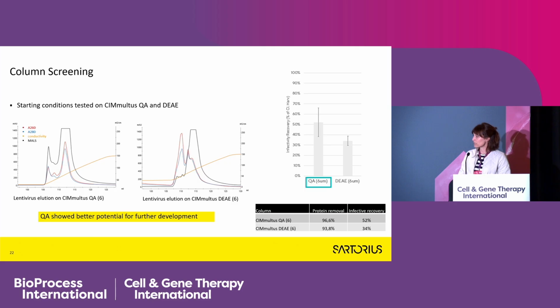We noticed that QA performed better than DEAE. It shows better potential for further development, especially because the infectivity recovery was higher. Regarding protein removal, both columns were more or less the same, around 90 to 96% protein removal.